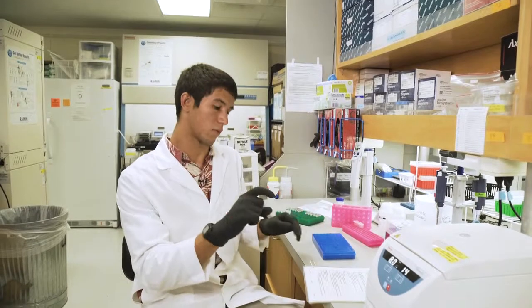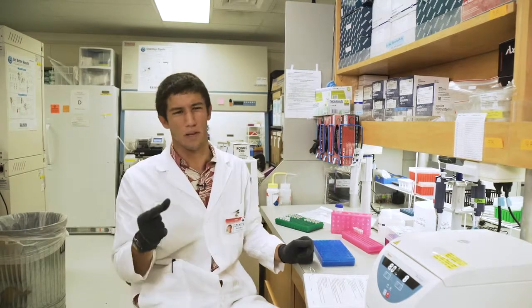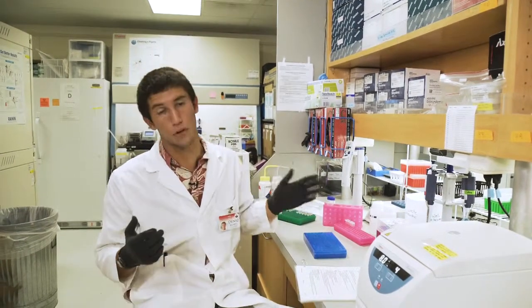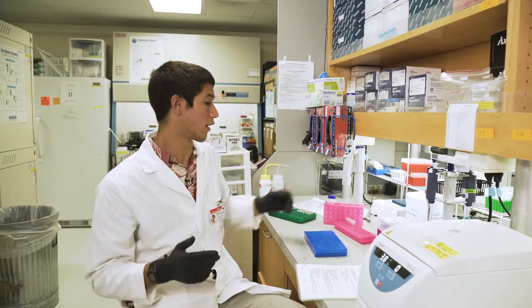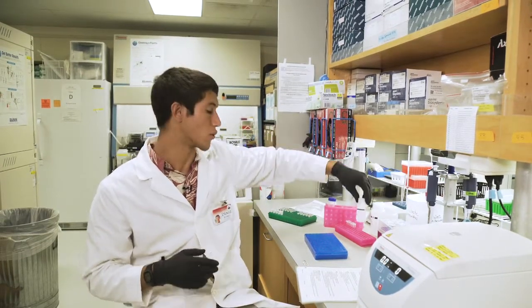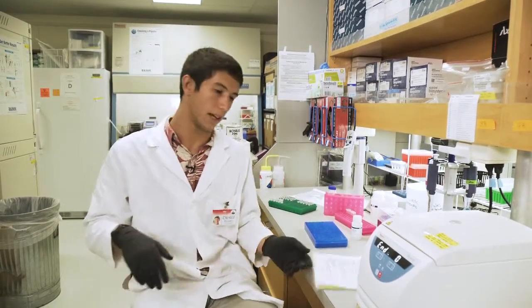Then we're going to keep the top, so the DNA is going to be on the top. There's going to be a few other things with the DNA that you can't see, and so we have 2 more wash buffers to run through the column. And then once it's fully washed, we have this thing called elution buffer, which will make the DNA into liquid again and let us collect the final volume of DNA.